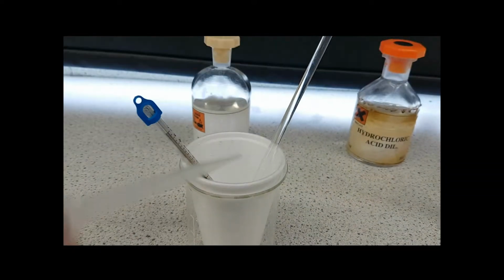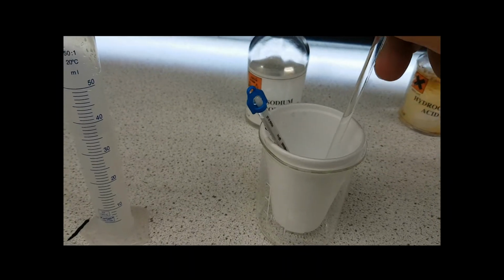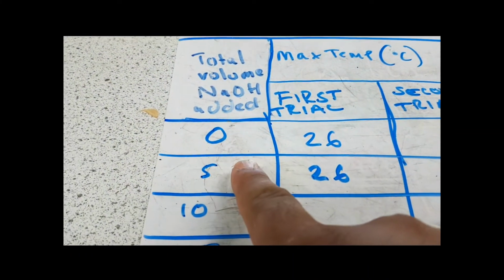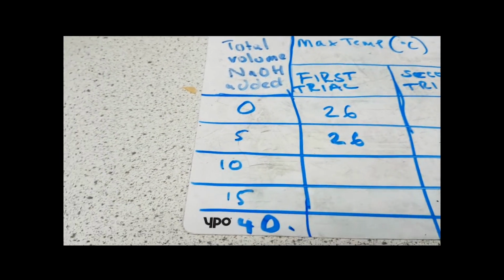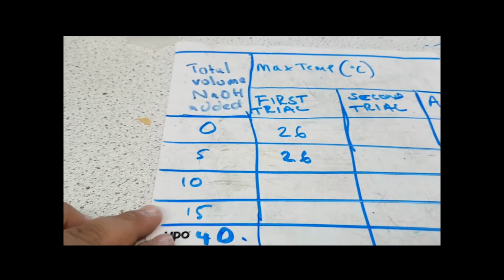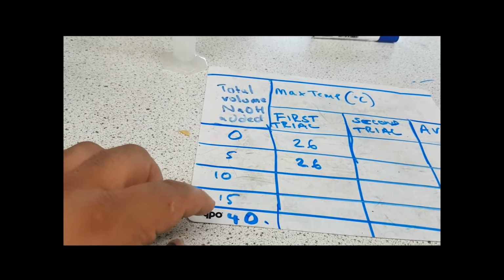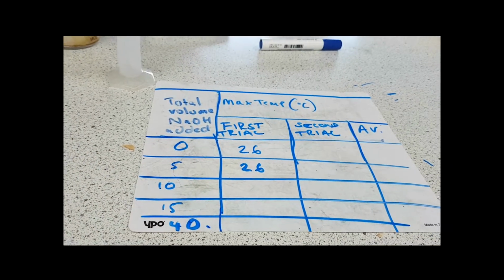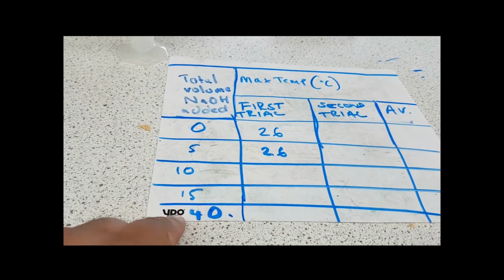Then once again, you're going to stir for about 30 seconds, and then get your results. So I've got 5 mil of sodium hydroxide, and record your temperature. You're going to do exactly the same for everything else. So you're going to have another 5 mil, which will make 10 mils in total, then another 5, another 5, another 5, another 5. You're going to stir for about 30 seconds and keep recording the result until you've got your full 40 mils in.